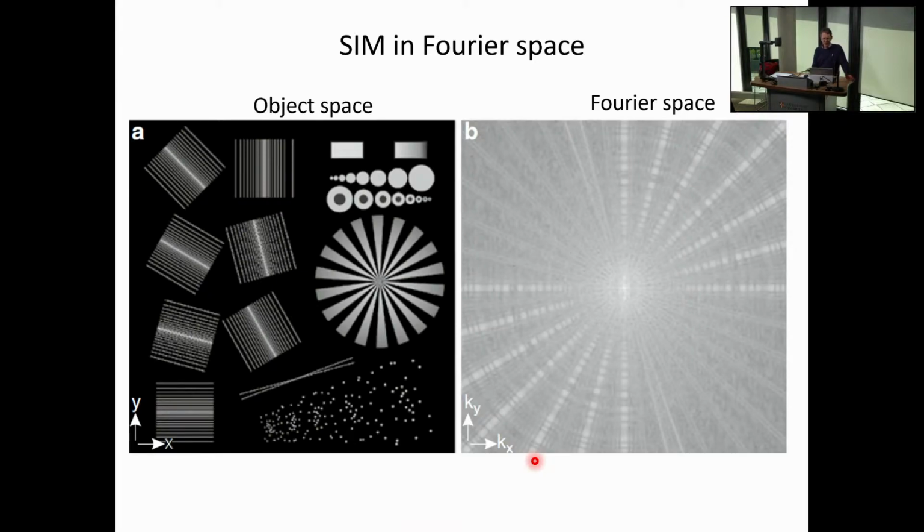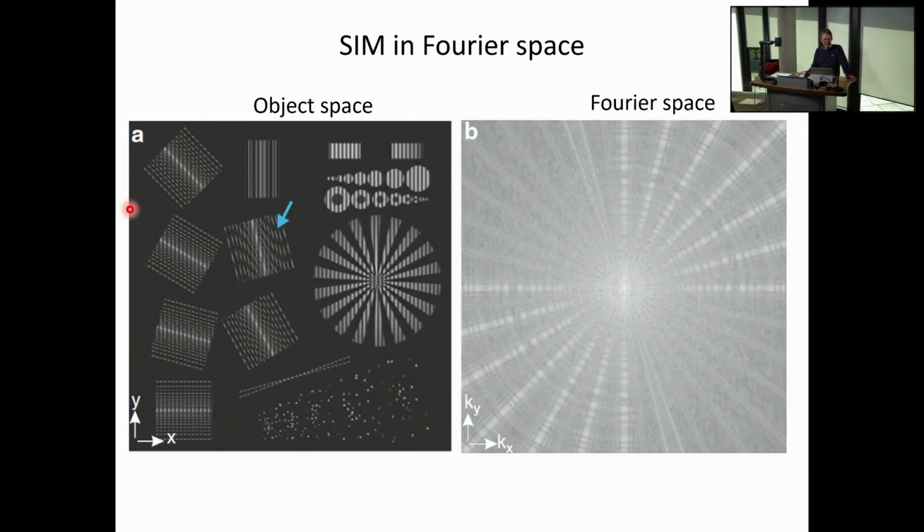What does that do? So here's the original object. I project the pattern on. So let's put the first pattern on. You can see already what happens, right? You can clearly see what happened. By putting on a pattern that is arranged vertically like this, as I go across, I'm modulating some of these frequencies. And for lines that are close to the arrangement of the illumination pattern, you can clearly see these low frequency moire fringes. So for this one, you've resolved it really well.